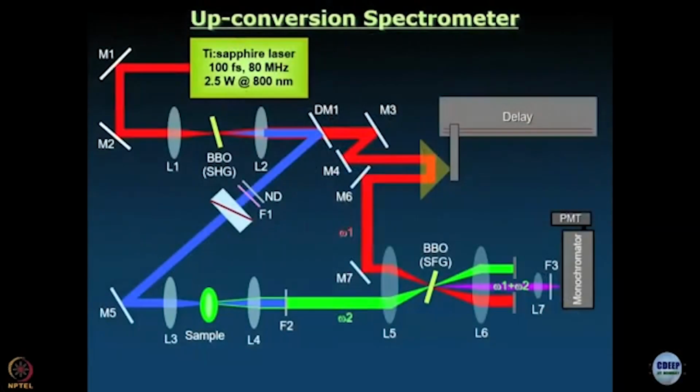Okay. But we have still not answered the question, where is femtosecond in all this? Where is the question of gating? That is what we want to do in the next module, when instead of using the photograph, we are going to use the schematic, and we will show you where femtosecond time resolution comes from.